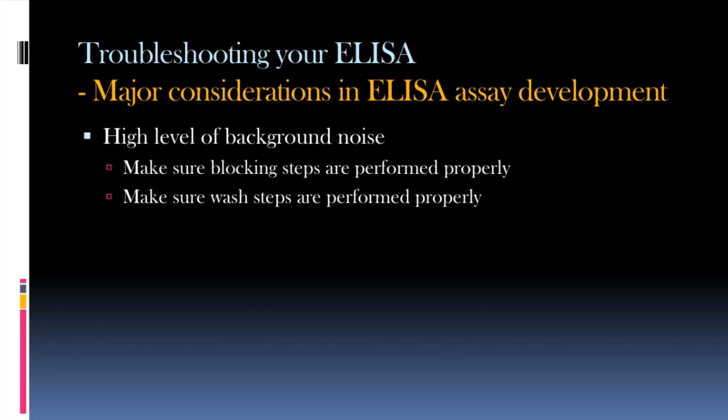Wash steps can be tricky. Usually ELISAs will give you a protocol that will describe how to wash the assay, and they'll typically ask you to wash 3 or 4 times or even up to 6 times after the addition of your antibodies or your antigens.